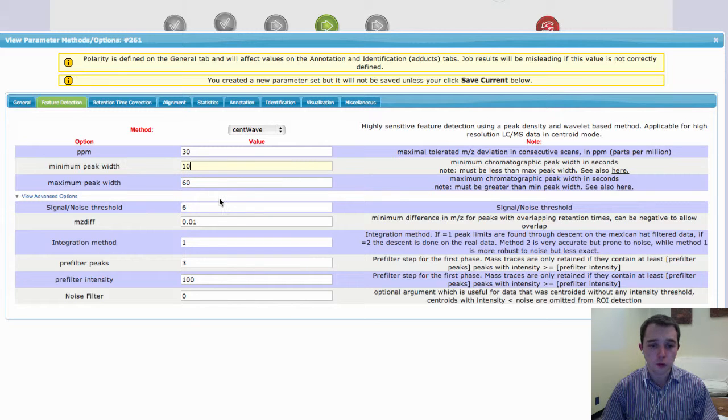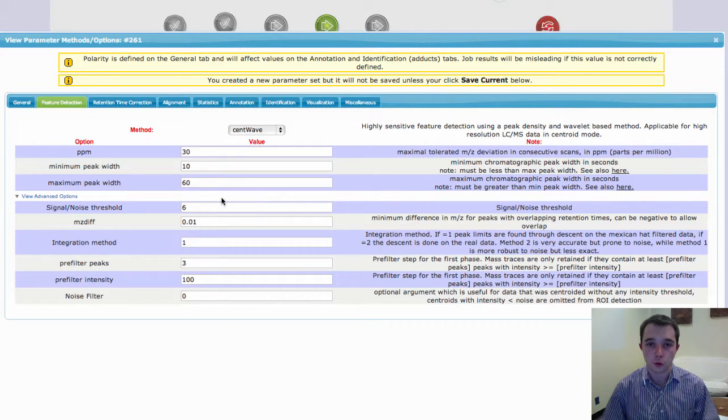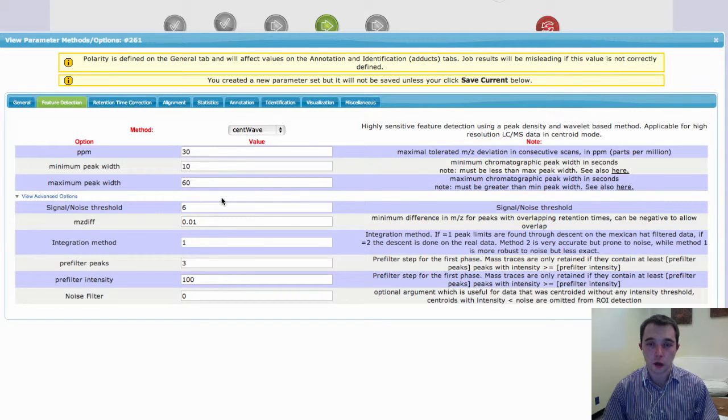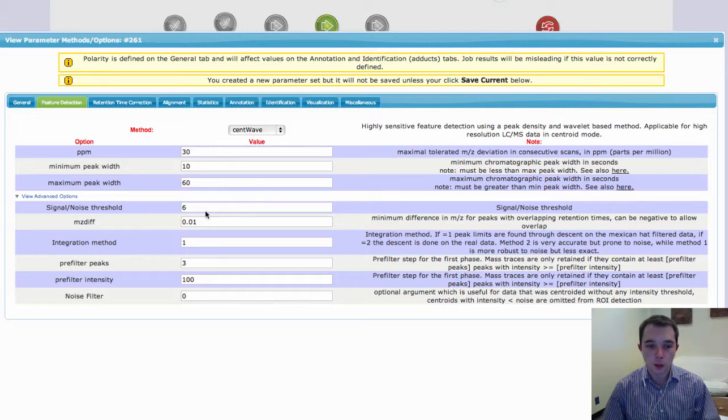So it's always a good idea just to have a look at your data on your instrument and just have a rough idea of what your peak widths are.